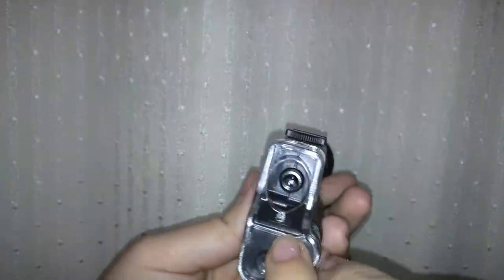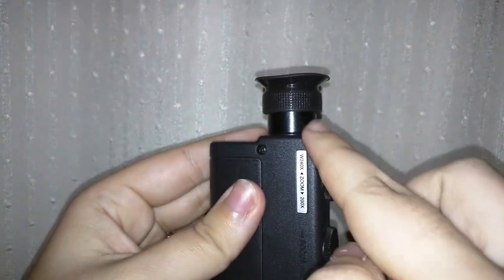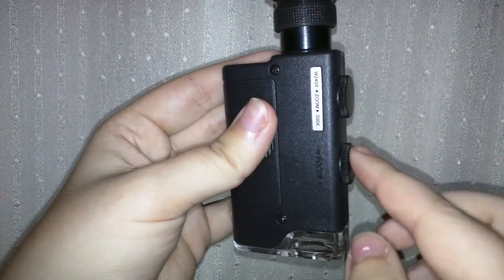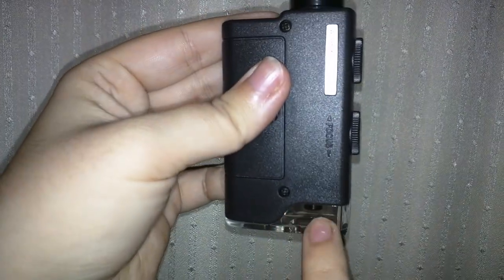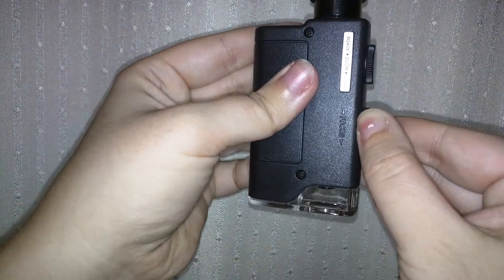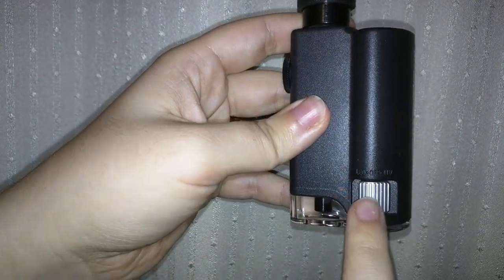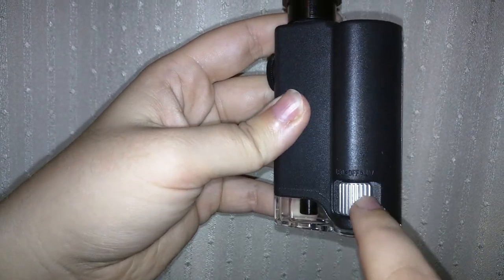There's the two lights you can see. This part right here is your dial for zooming. And then this part right here is for your focus. You can see the little part right here, the microscope going up and down. And it does have two different light functions. So you've got the LED, off, and the UV.